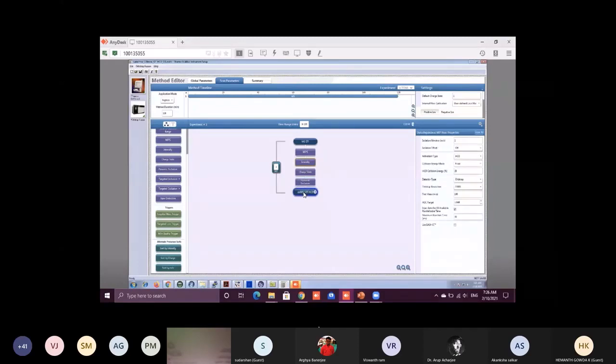In MS/MS mode, we have kept an isolation window of 2. We are using activation type as HCD. You can use CID and ETD depending upon your experiment. And we are using collision energy mode as fixed. You can also set it as stepped or assisted.